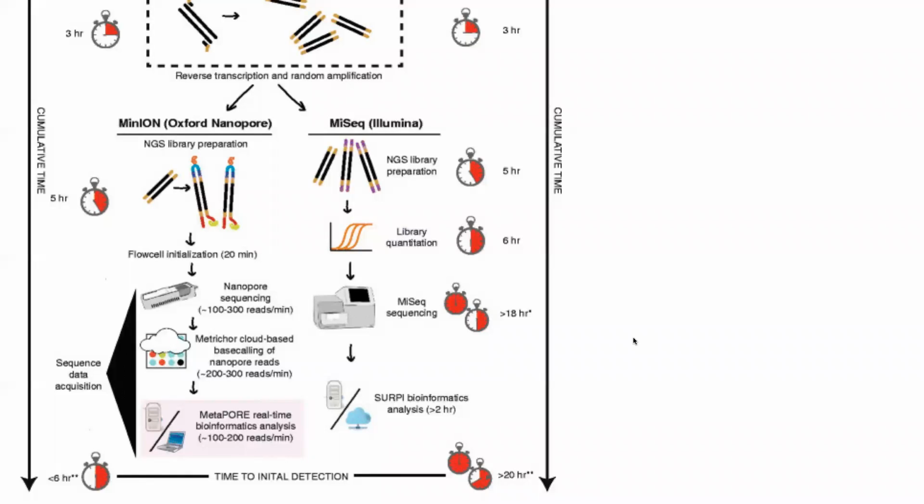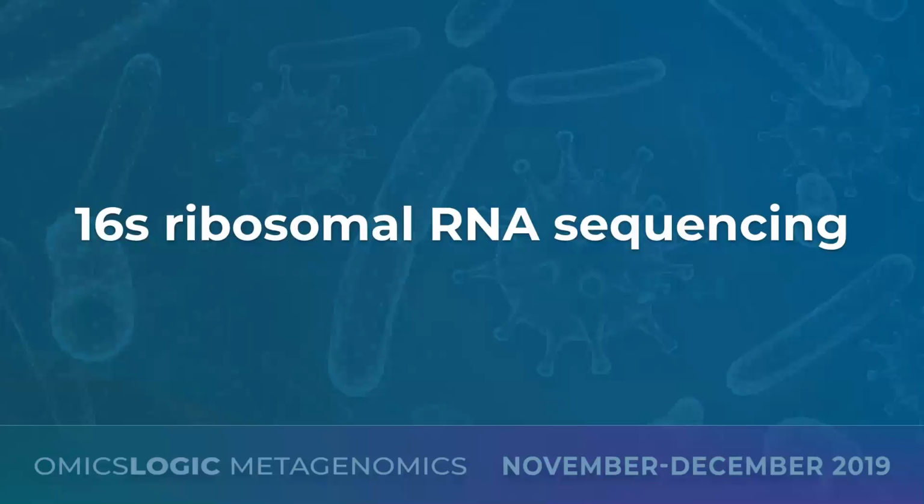But to understand how these technologies work, and knowing this example of sampling from the natural environment, let us talk a little bit more about how 16S ribosomal RNA sequencing works.